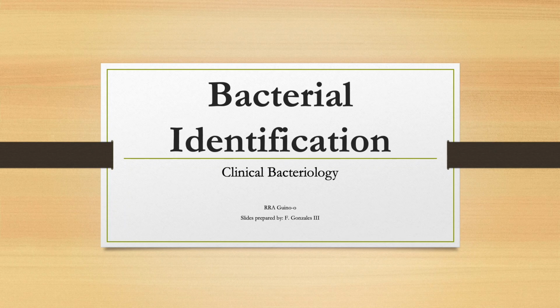Good day, everyone. Today we will be talking about bacterial identification in the clinical bacteriology laboratory.